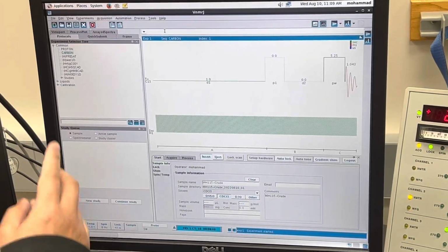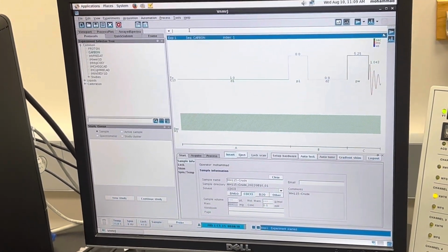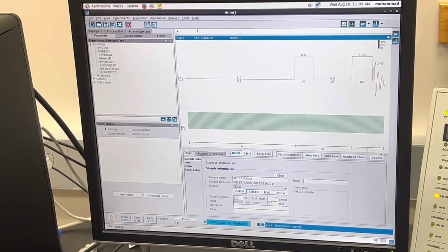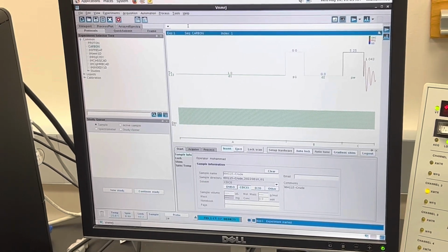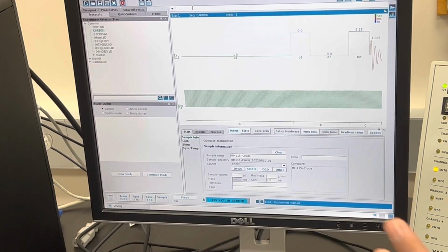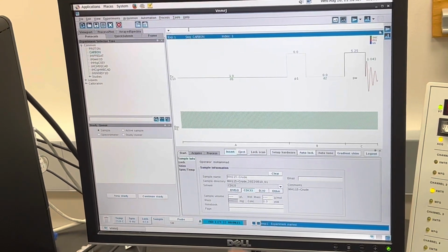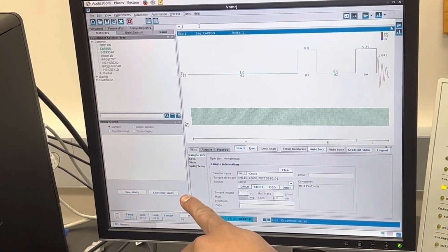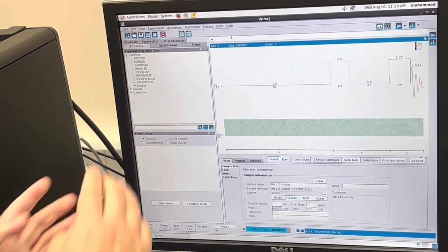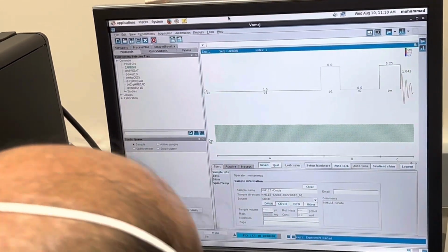So if you put it here instead of in the starting queue, it won't start again, because you already did the shimming and the locking, and you don't want to do it again. Oh, okay. So first I do the proton, which takes care of all the shimming and everything. Then for carbon I don't need to do it again. If I double click here, then it will do everything again, wasting time. So you put it here and then you just manually start it. Do you understand?